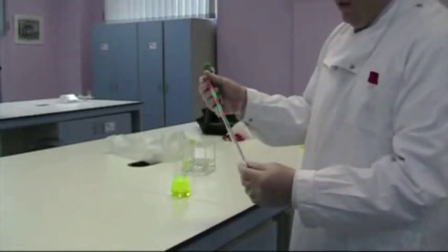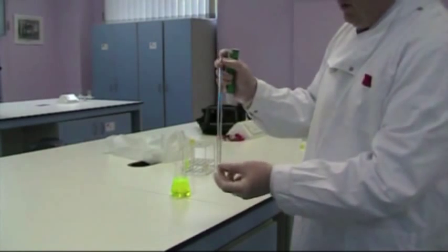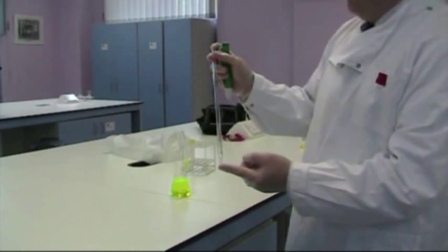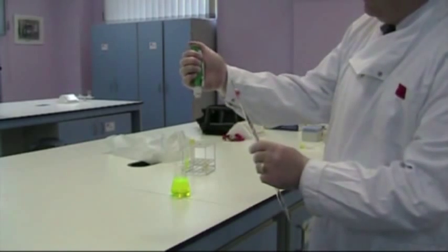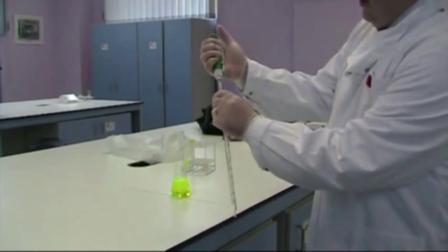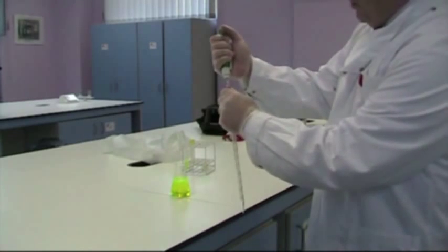So the next pipette to look at is called a pipe pump, and this must be used with a graduated pipette. And there are various types of these, and you'll be shown which one to use in the laboratory. So in order to use this, ensure that the first cap is pushed down to the bottom, and with your hand quite near the top, because we don't want to break the glass, just very gently squeeze it into position so it's held.